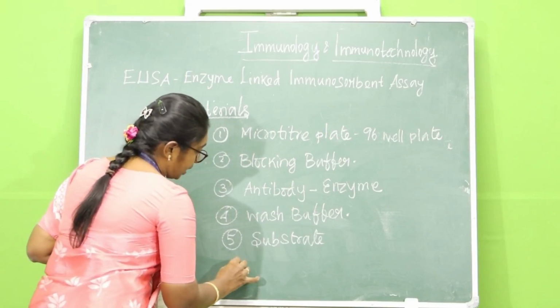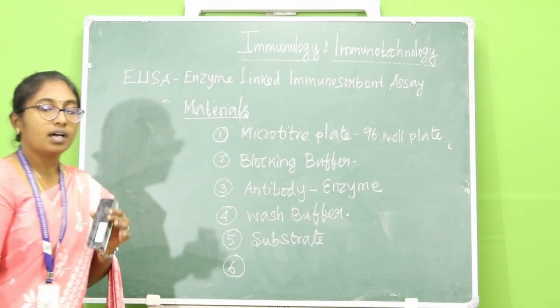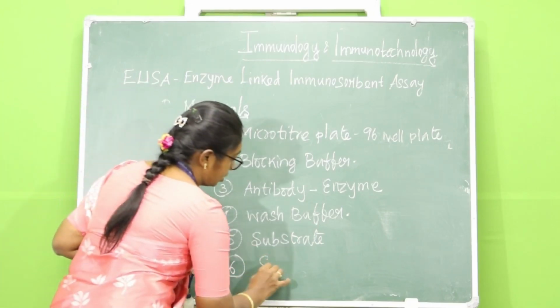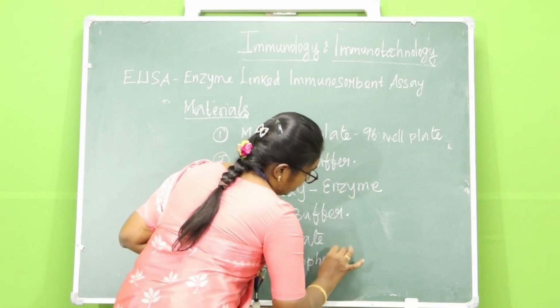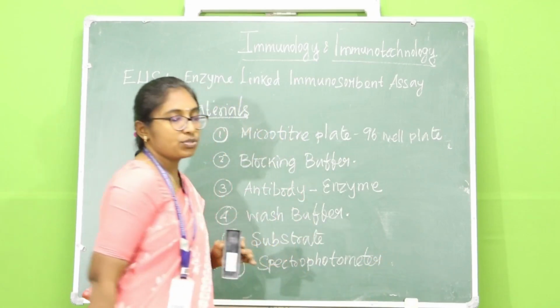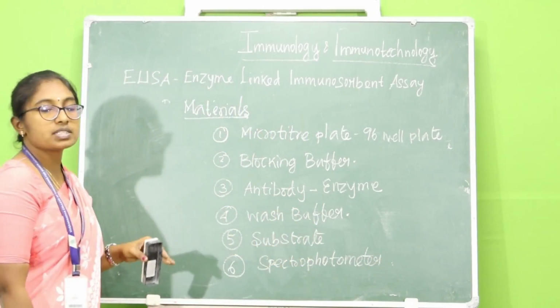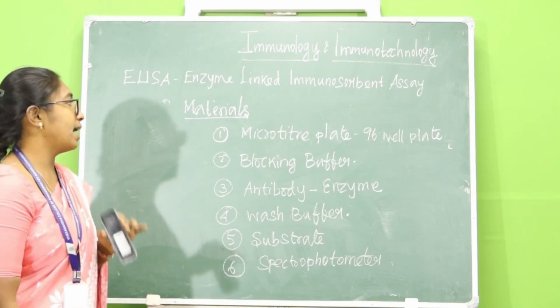And also we need a spectrophotometer to quantify or to diagnose what is present in the sample. To find the concentration, we need a spectrophotometer to analyze the concentration of an antigen or an antibody.